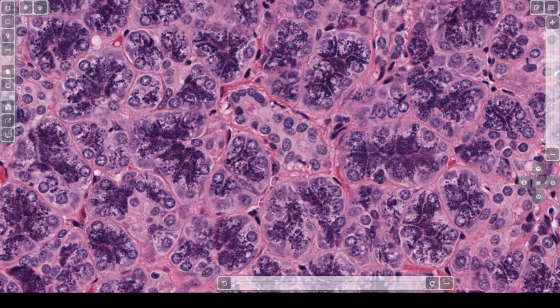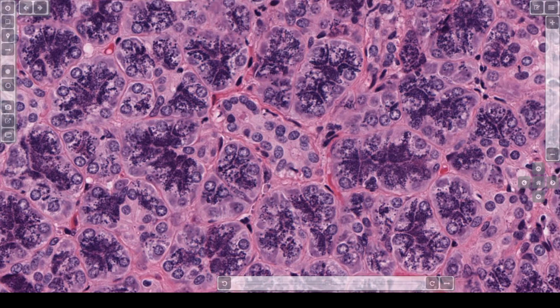the individual cells. The acini also have myoepithelial cells along the edges. Here is one myoepithelial cell, here is another myoepithelial cell, here is one myoepithelial cell, here is one myoepithelial cell. The myoepithelial cells are important because they have contractile effects around the acini that help move the fluid through the ducts. The parotid gland is composed almost entirely of serous acini.